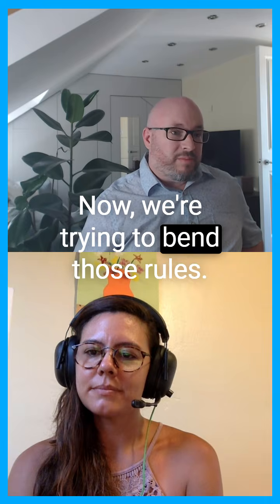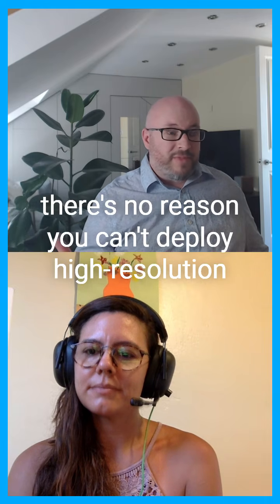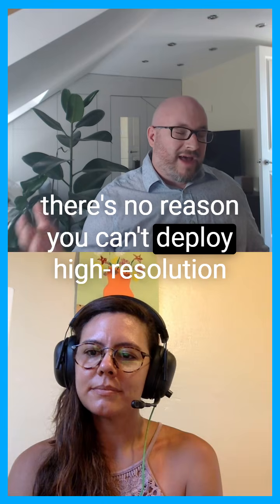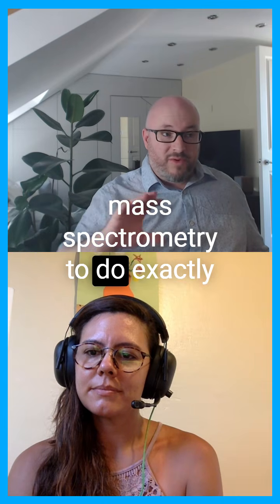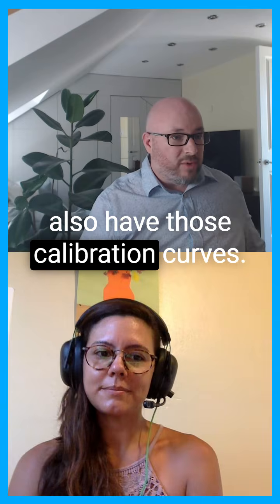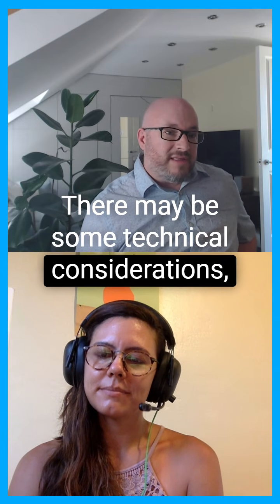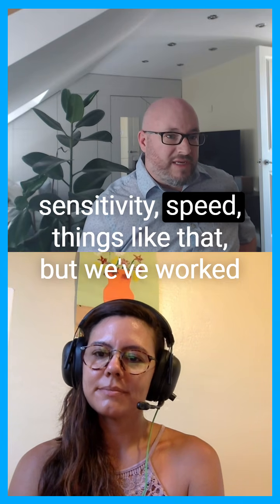Now, we're trying to bend those rules. We're trying to fill in the gray space between, because there's no reason you can't deploy high resolution mass spectrometry to do exactly the same thing and see more, as long as you also have those calibration curves. There's no reason at all. There may be some technical considerations, sensitivity, speed, things like that.